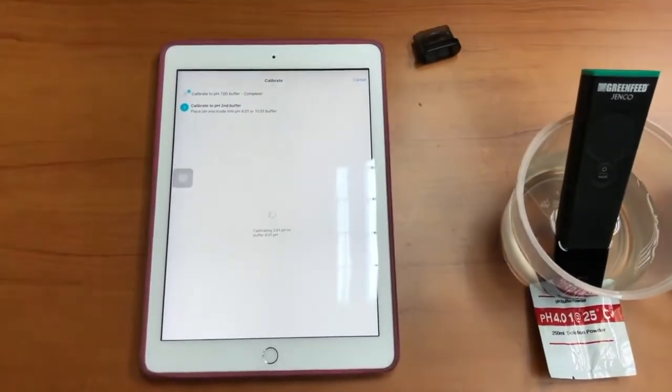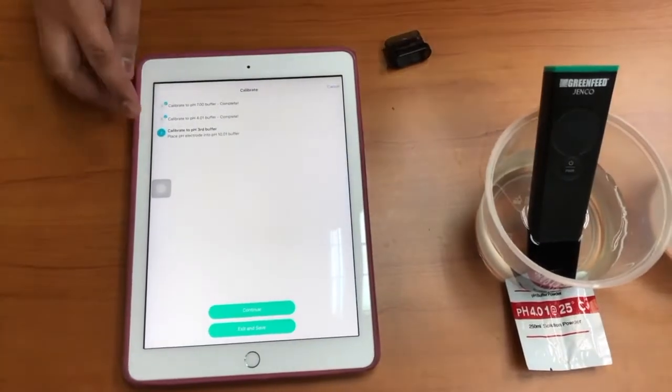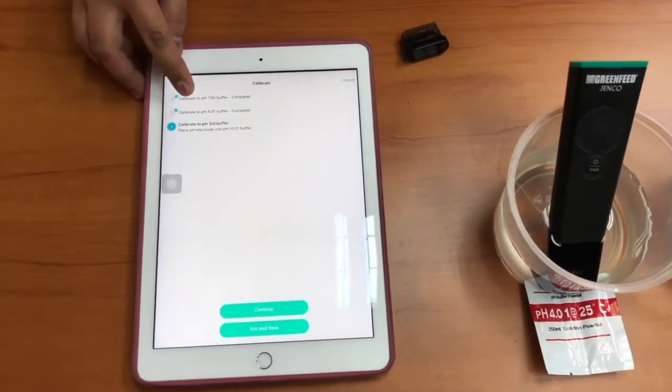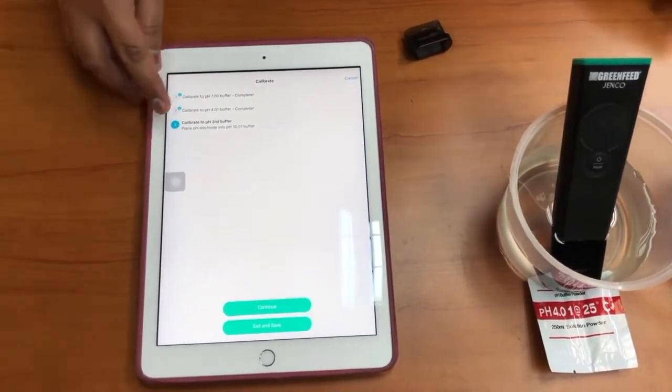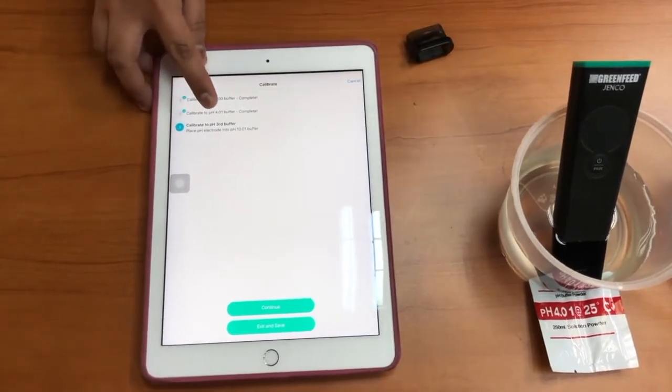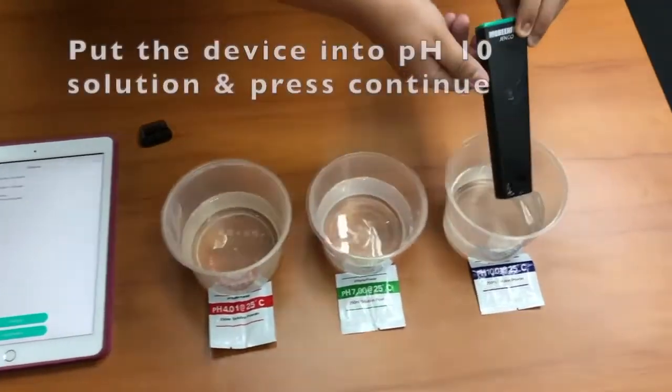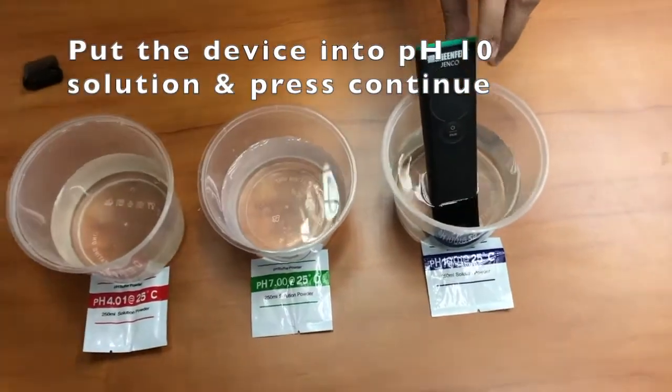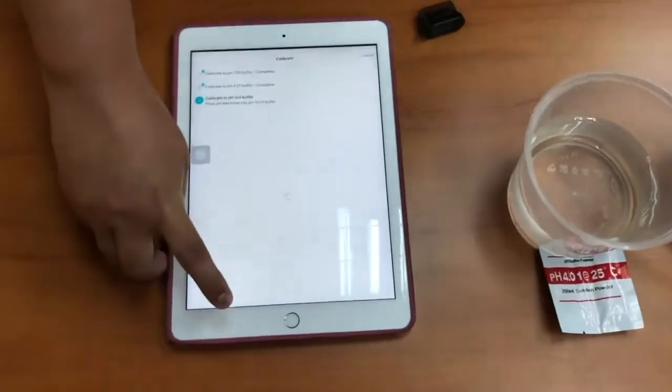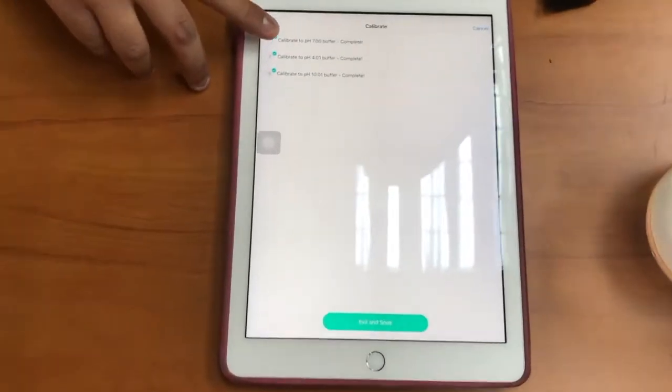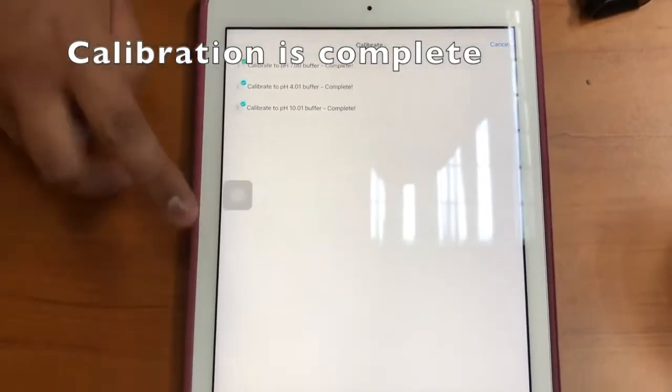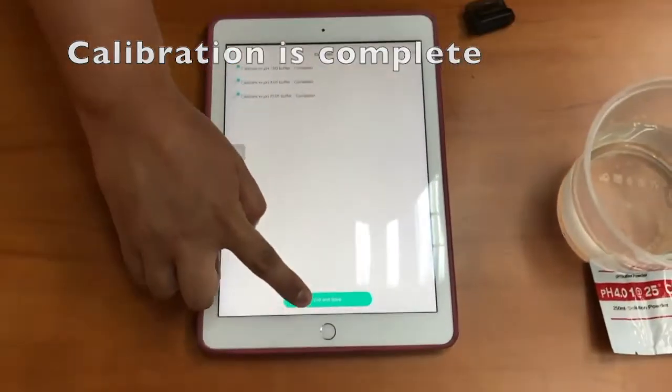After finishing calibration of the second one, which is pH4, now we're going to calibrate the third one in the third buffer, which is pH10. We move this pH meter into the pH10 buffer and continue to calibrate. After completing all three pH buffers, we can click save and exit.